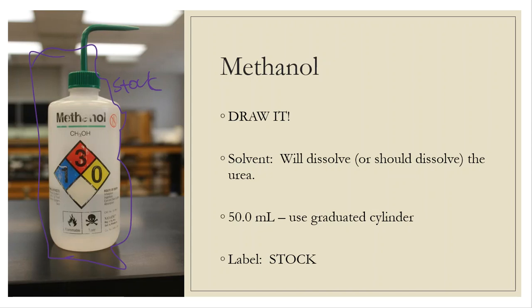But it seems like often when we use methanol, we need it to be ice cold or we need it to be cold, not at room temperature. So we just made the decision to keep all the methanol in the fridge and just call it a day. And that's just what we use whenever we need it.